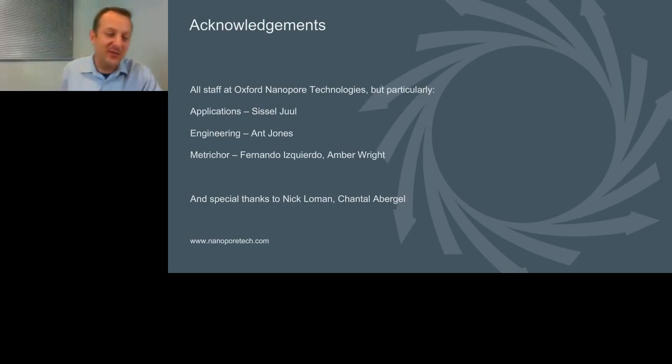Yeah, very well observed. Yes, it does mean that you, well, okay, I'm going to have to phrase this very carefully. It is potentially possible to customize the WIMP database. It is not something that we've currently released as one of the workflows. So if you use the WIMP workflow today, it will come with canned workflows for canned databases for bacteria, for viruses, and in the very near future, fungi.